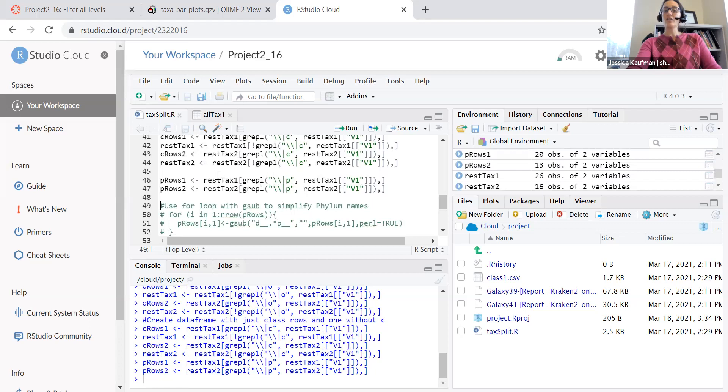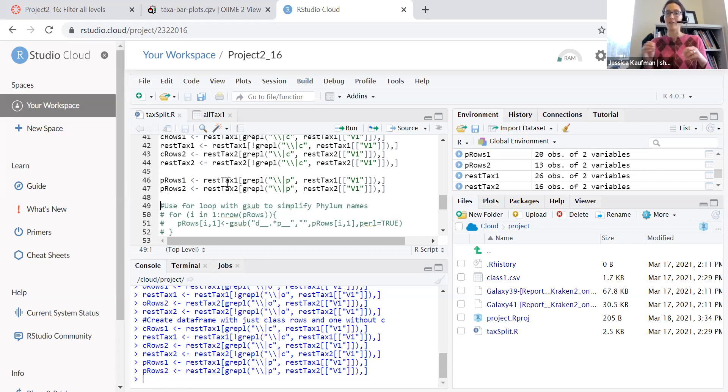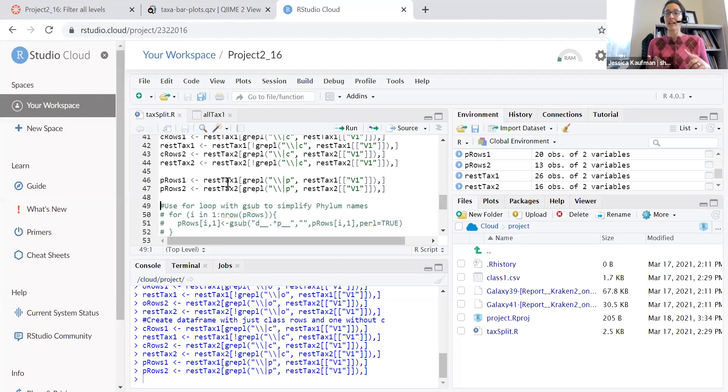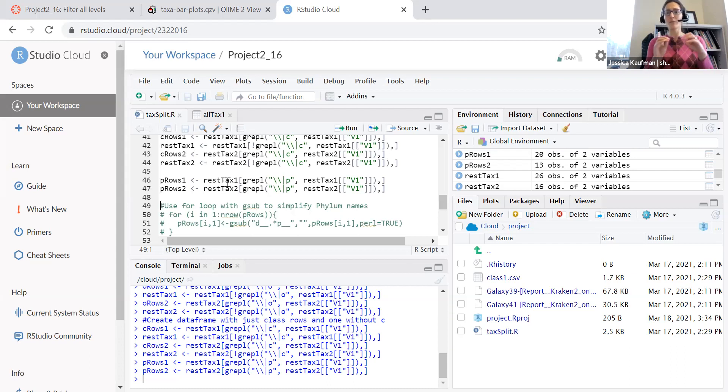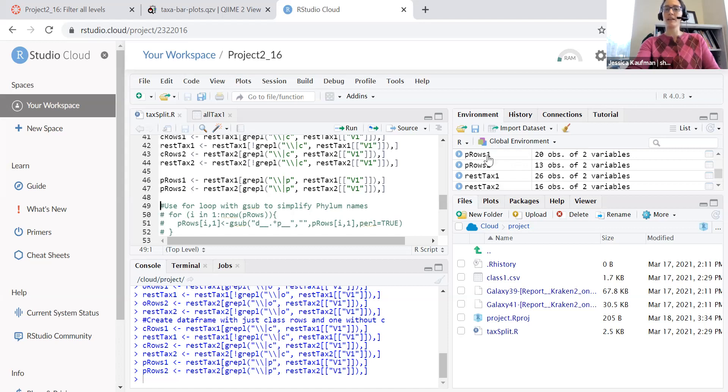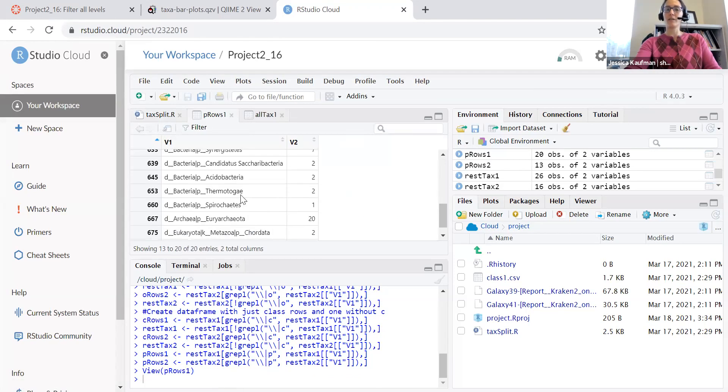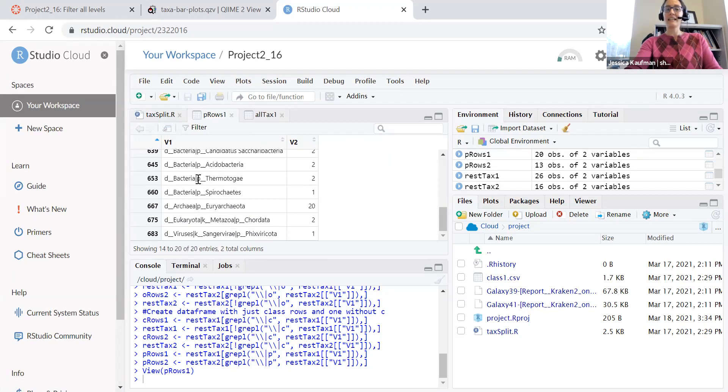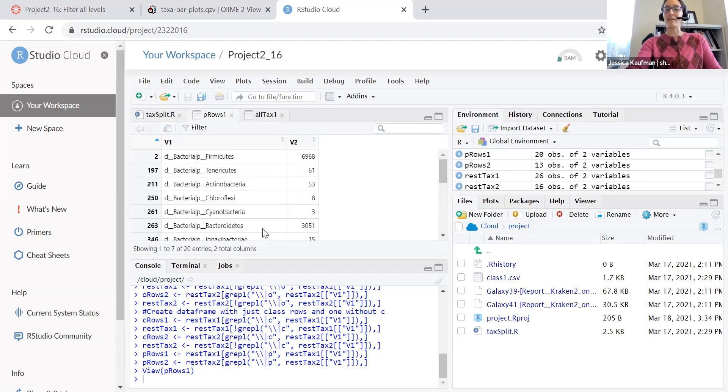If I make sure that the phylum rows have a P in them, it will also get rid of those rows that were a problem last week for some people on their graphs where it's a classification to the kingdom. So just to bacteria or to a domain. So the D and the K rows are not going to be included in my P rows. I can click on them to double check that that's true and I see that there are no rows that don't have a P, that don't have a phylum.